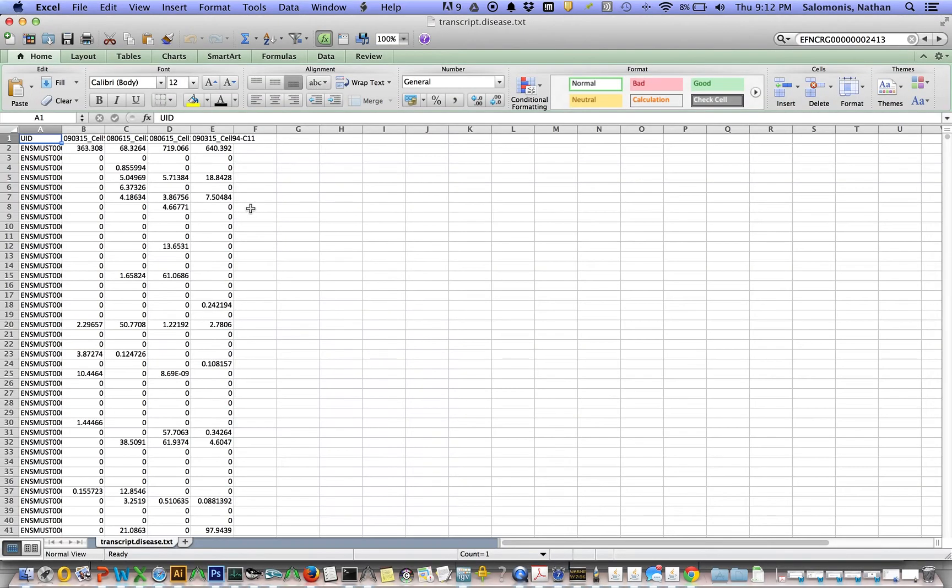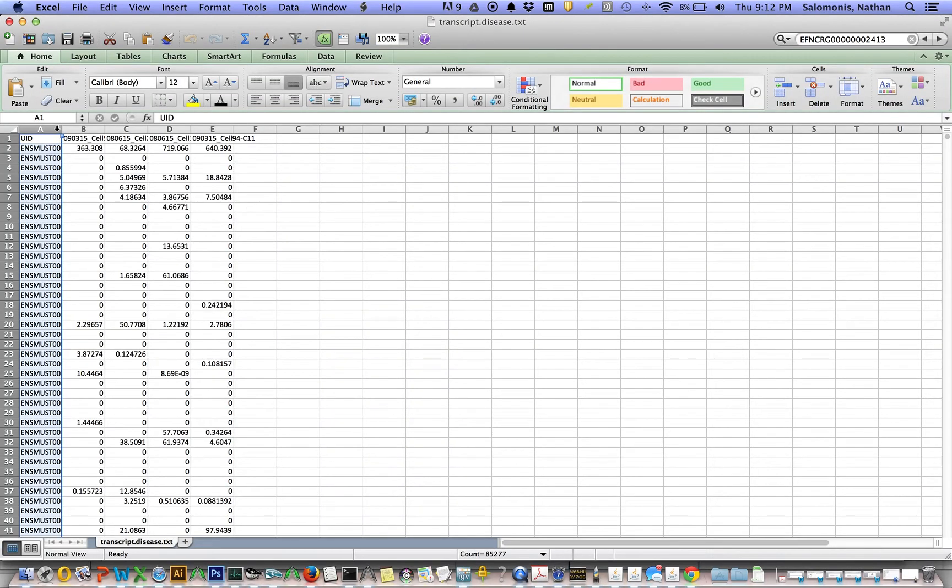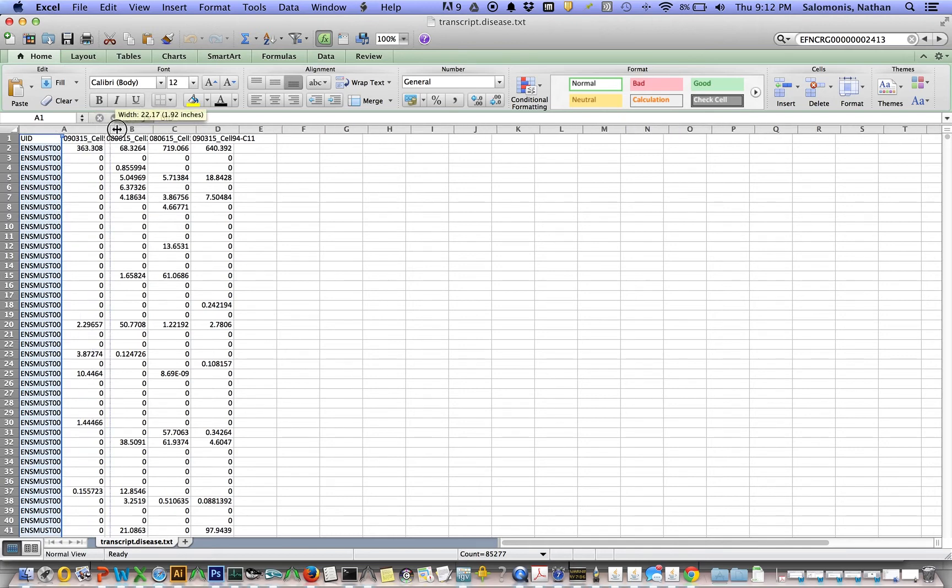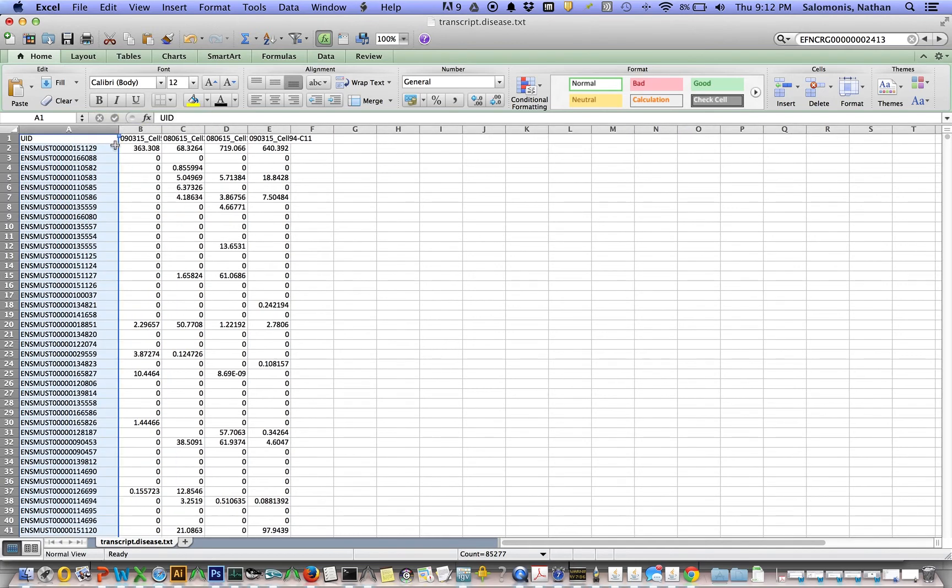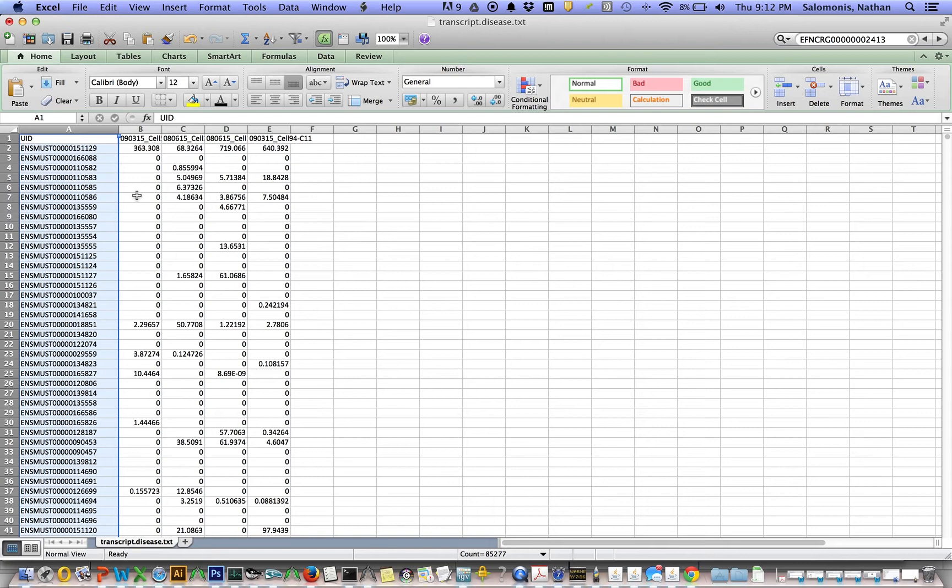The gene expression levels are based on transcript expression levels that are produced through Kallisto. And in this transcript file, we see that there are many more than 29,000 genes. There's actually 85,000 transcripts. And if there are, let's say, four transcripts per gene for that individual sample, the TPMs for that gene for all the transcripts will be summed to arrive at a final gene expression value.